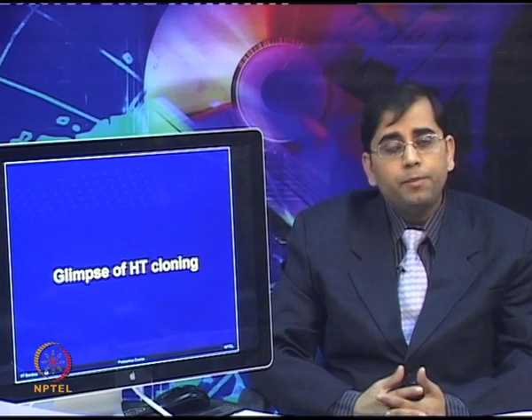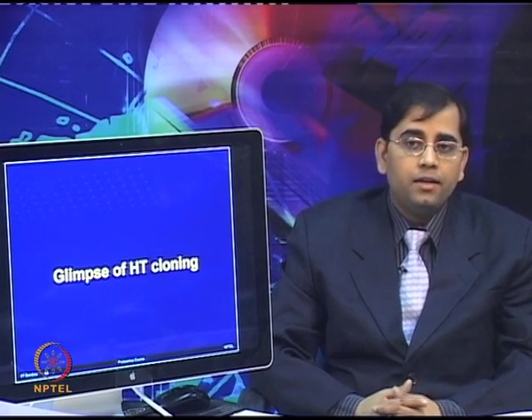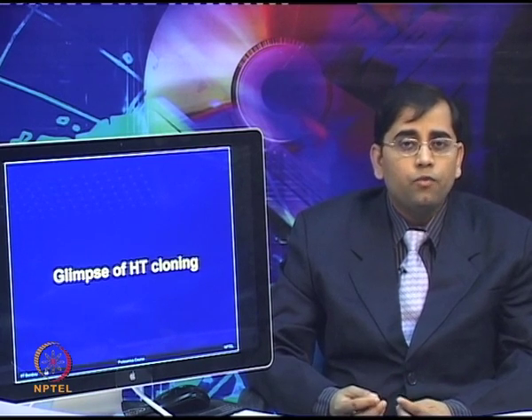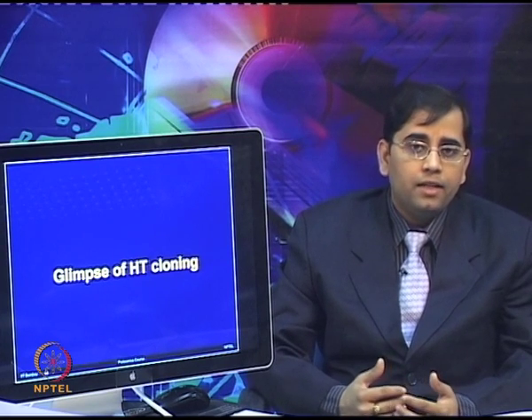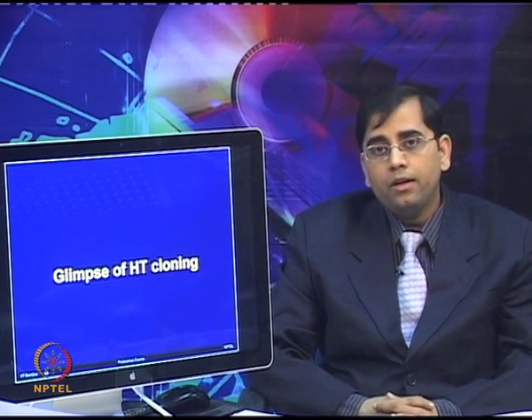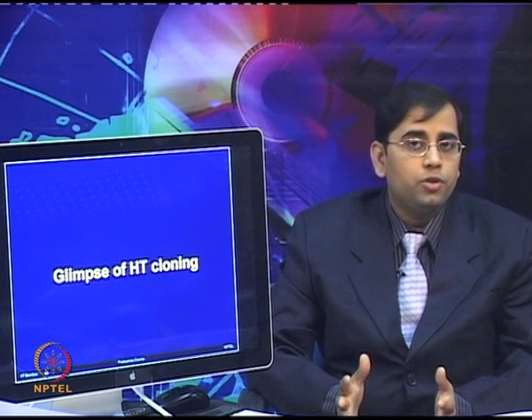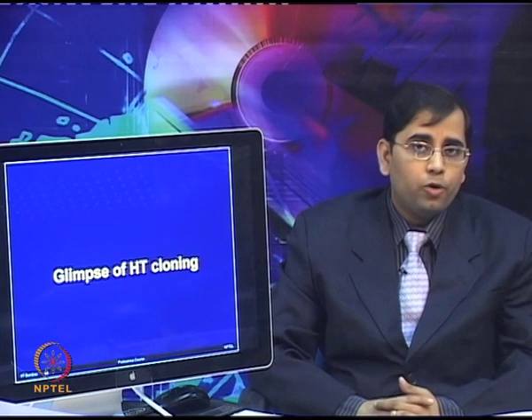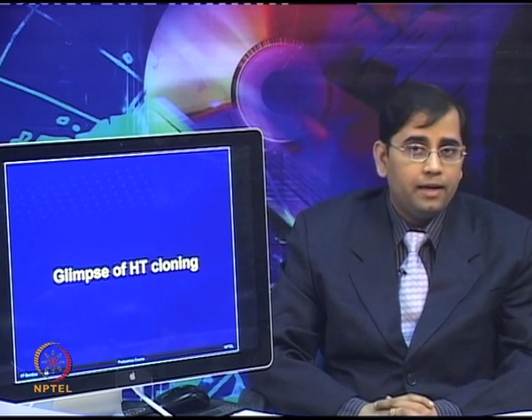It is especially evident when you are doing the gel loading or colony picking, which are very error prone processes during the cloning process. If you are performing the manual steps in the high throughput thousands or even larger numbers, there is a good probability that there will be errors.